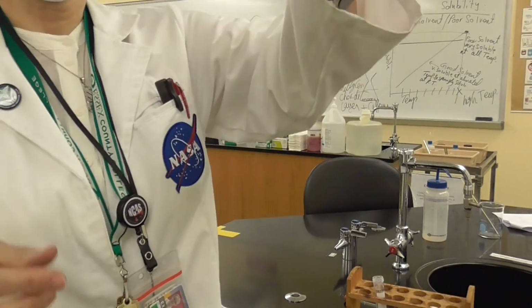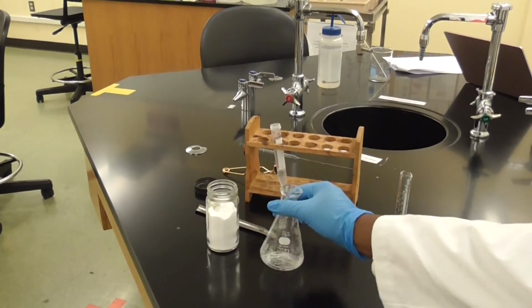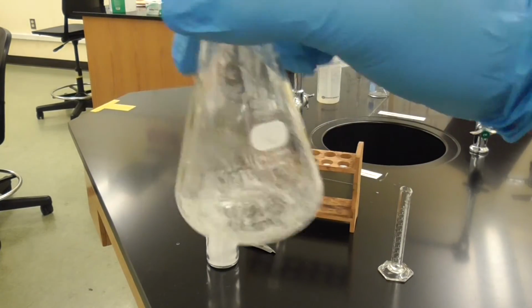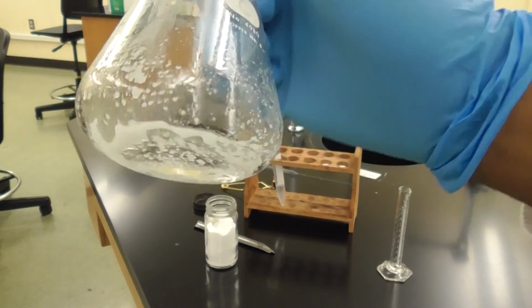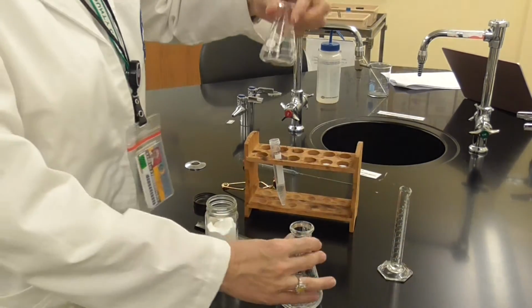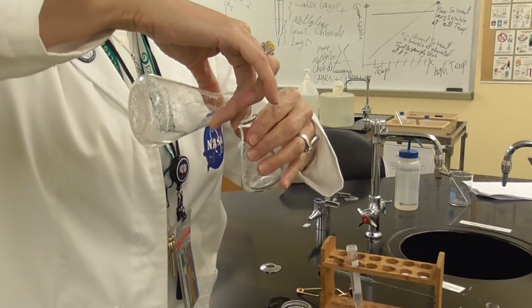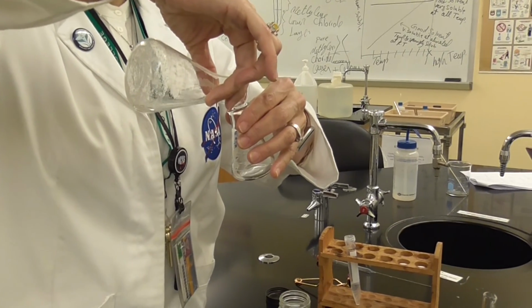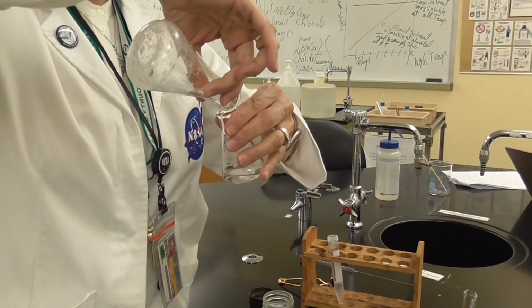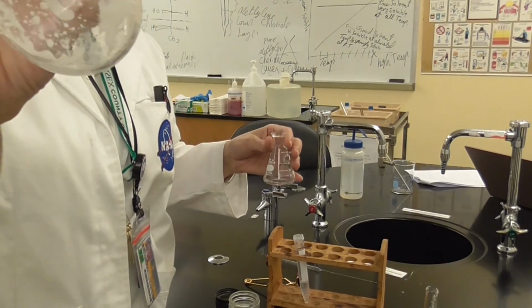Okay, so now I'm going to take the smaller one, the 50 ml one. That one here. So we're going to decant, we call it, transfer it, holding it without bringing any of the anhydrous sodium. So you see it's stuck at the bottom.